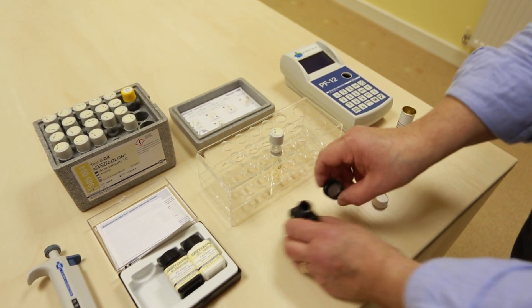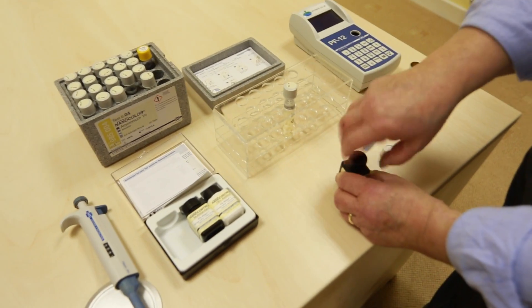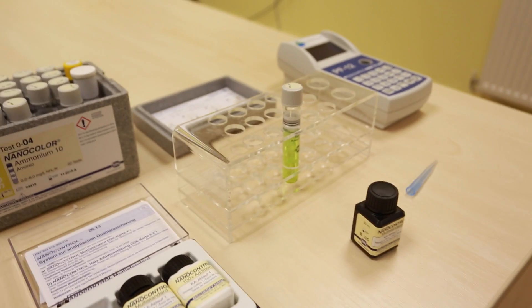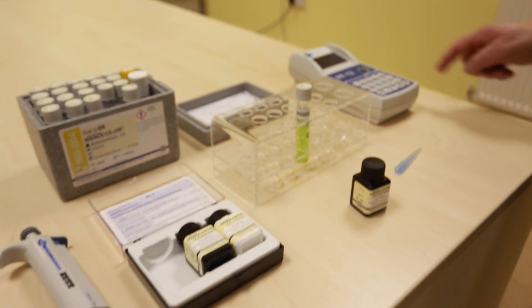That will develop a green colour over the next 15 minutes while we go and do something else. 15 minutes has elapsed.